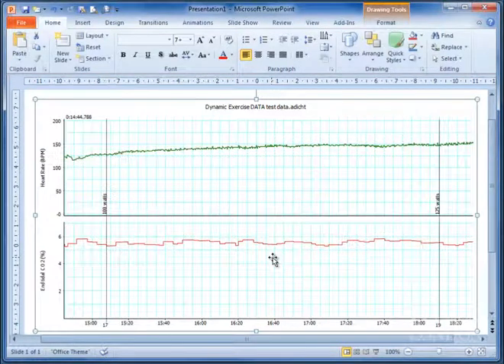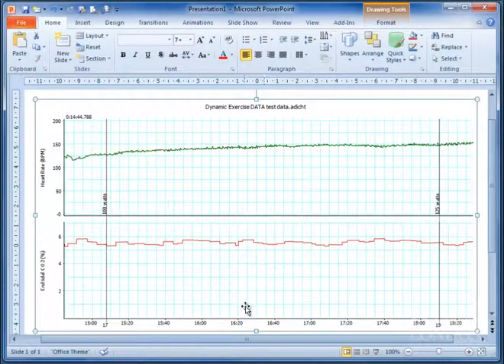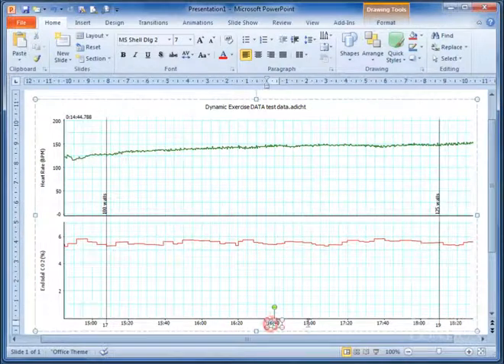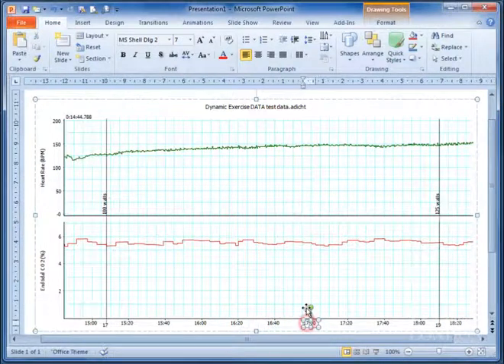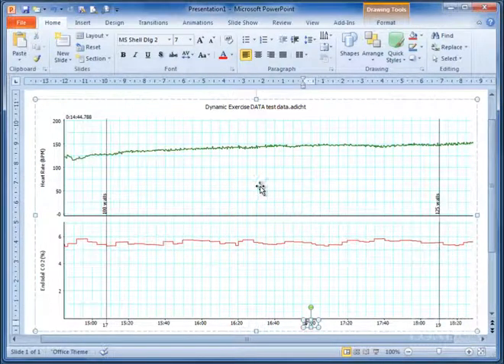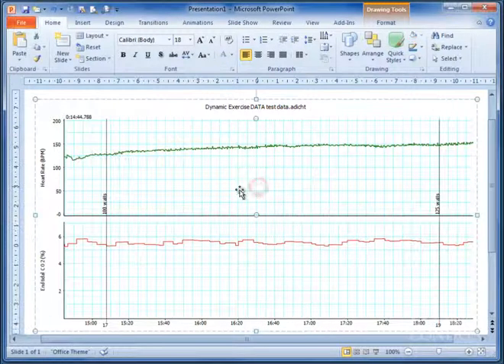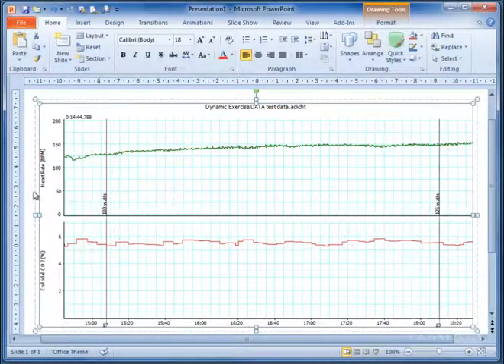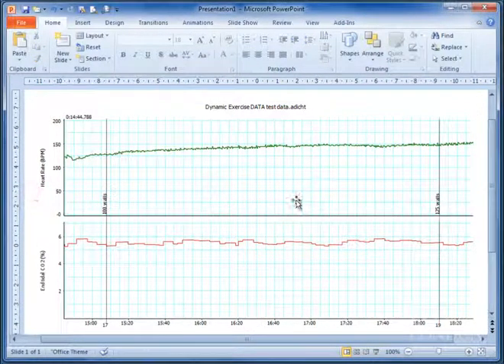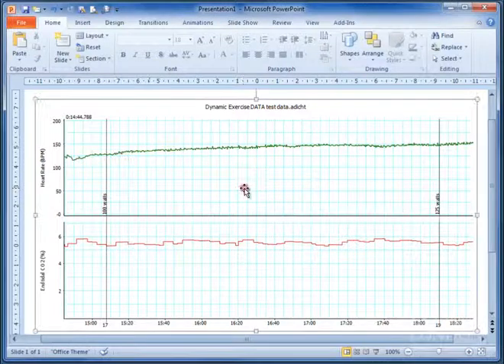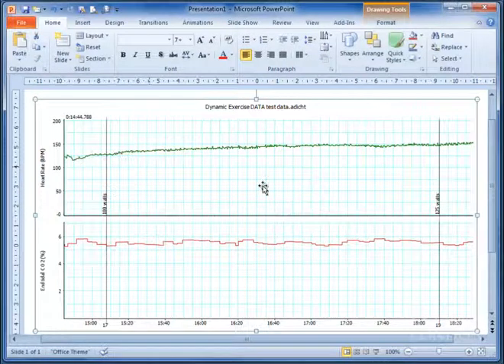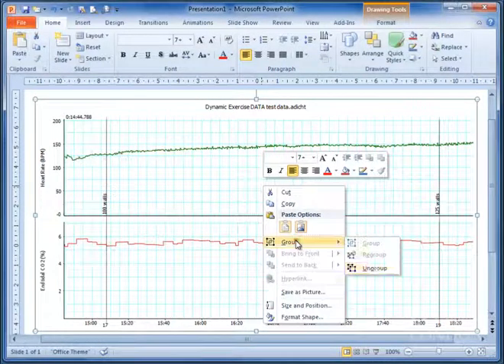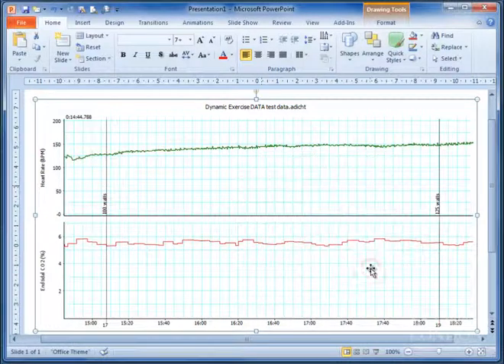There we are now. This is a drawing object within PowerPoint, and if you click on any of these objects, you can edit them. This is grouped at the moment, and you probably use grouping in PowerPoint to keep things together. So it's rather annoying. If I want to edit anything, I have to keep clicking everywhere. So I'm going to click on the entire picture, use the right mouse button, and choose group, ungroup.